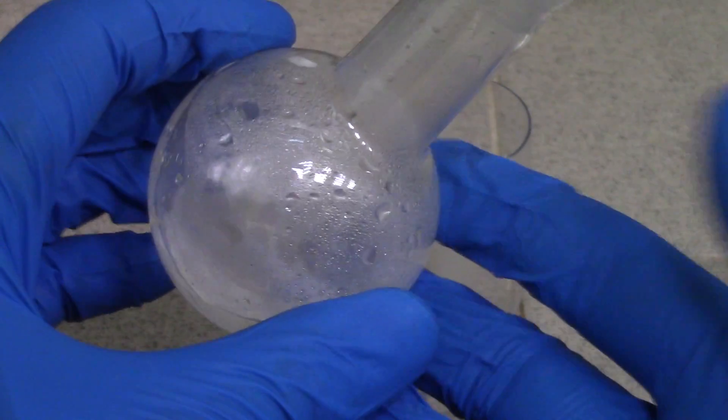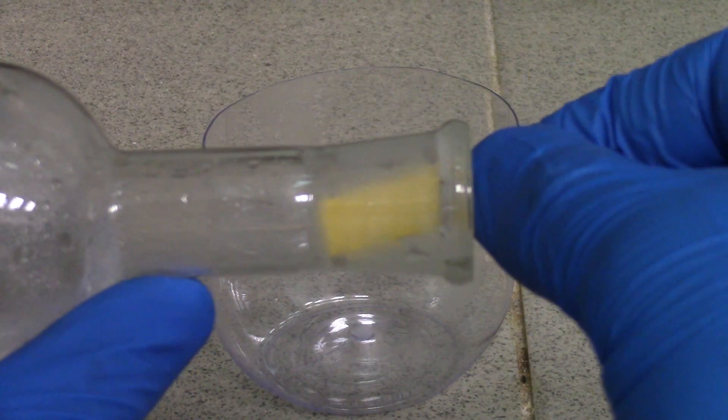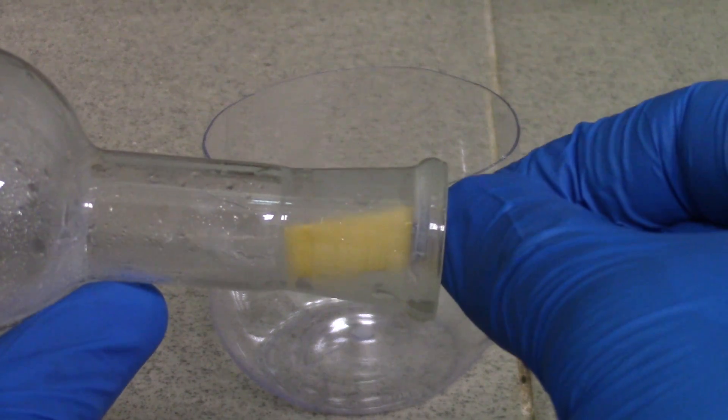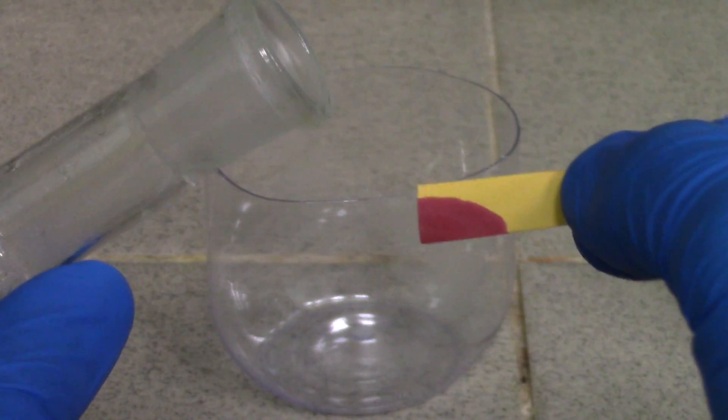Oh, the flask becomes a little bit hot. And finally, I have tested its acidity using indicator paper. This results in pH above 2.0.